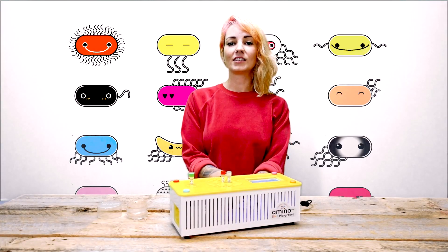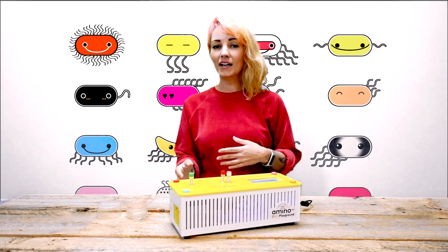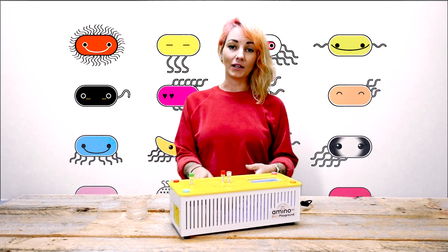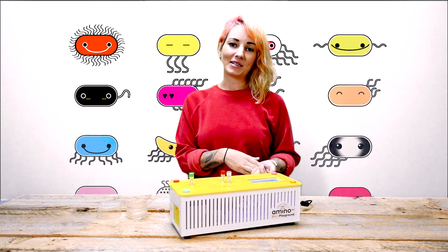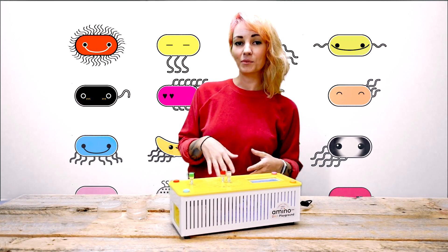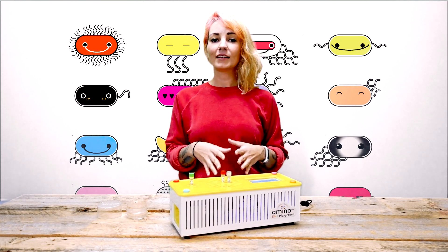Compared to traditional lab equipment, the DNA Playground is great because it's mess-free. You don't need hot water baths, you don't need buckets of ice, you don't need all that mess. It's also all-in-one — all your stations are here for you to use. It's more affordable because there's less equipment to buy, but most importantly it's really easy to use. That means that if you're a beginner, if you're new to the science, you'll still get started right away and get great results.